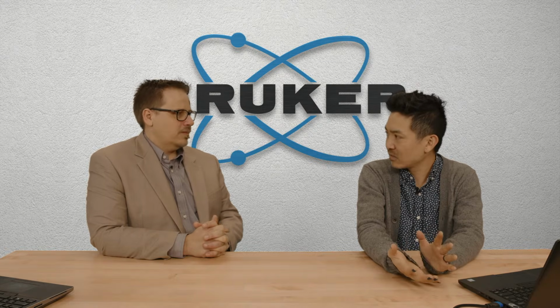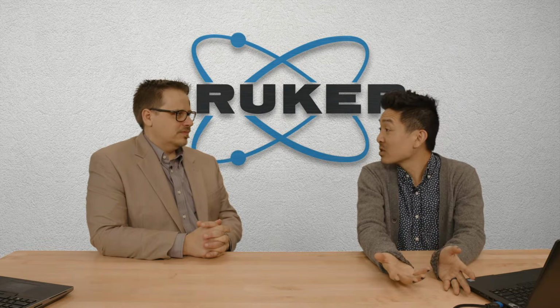But you could see in there, actually, with the phase ID, there is still intrinsic knowledge. Well, I always like to think about it this way: a more experienced scientist will always come to maybe more laborious work, right? Yep. But any sort of specialist is going to have these instinctive things. My background's in chemistry.